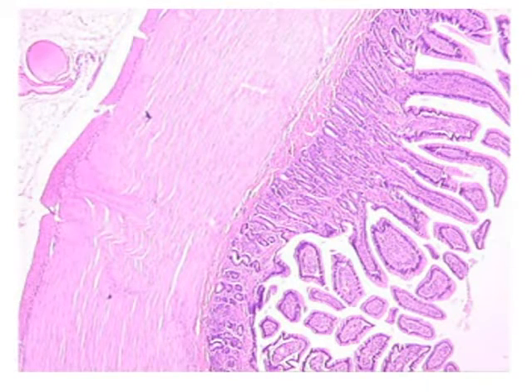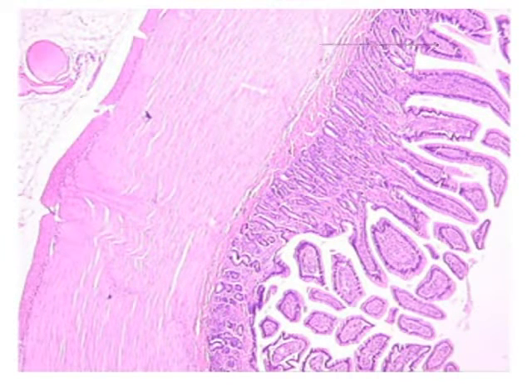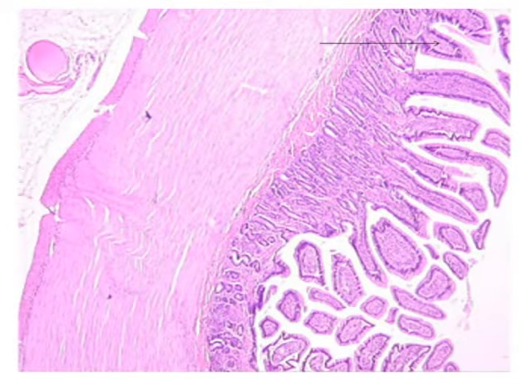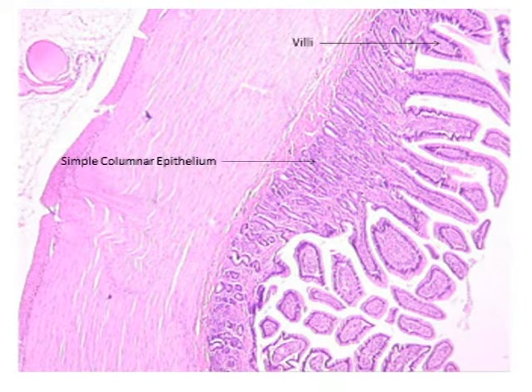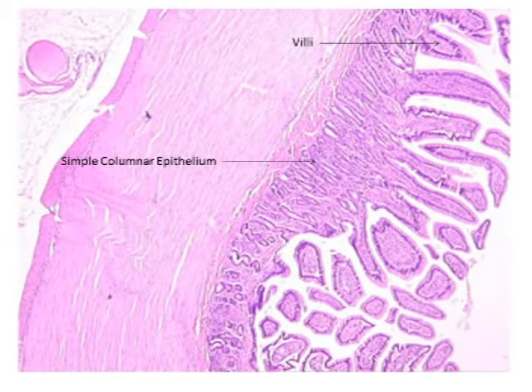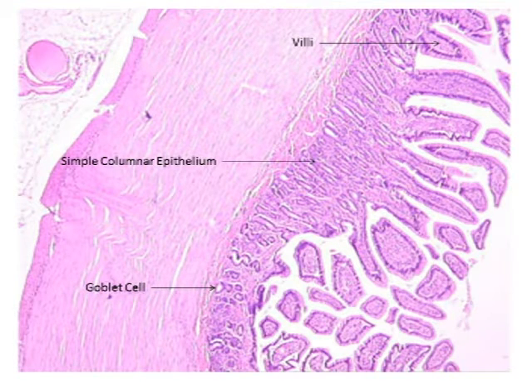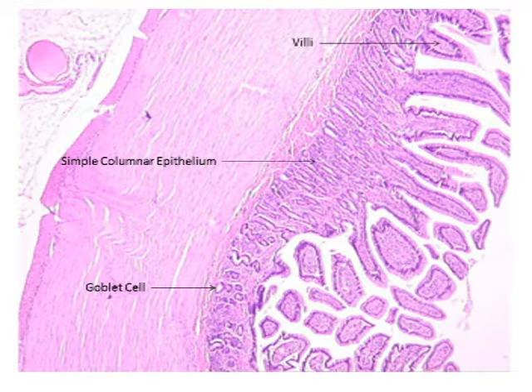Next is the small intestine duodenum. The first thing is the villi — the villi are the things that stick out from the other tissues. Next is the simple columnar epithelium, which is the layer at the base of the villi. You also have the goblet cells, which are the white circular areas with a white space in the middle.